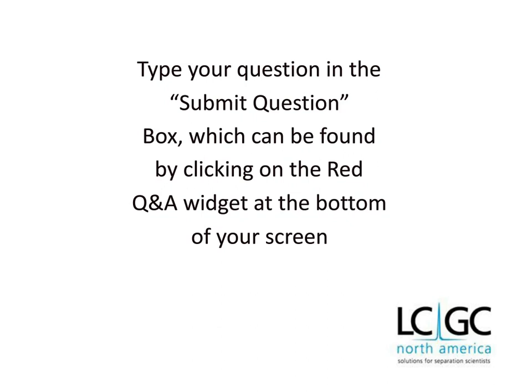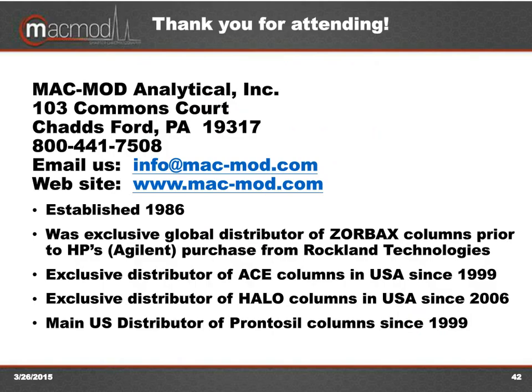Okay, Tom, our first question is, can you please explain once again what is the orthogonal column? I know about orthogonal selectivity like HILIC in some applications, but not columns. Thank you. Well, certainly different modes of chromatography can be orthogonal, like HILIC compared to reverse phase separations. But in the reverse phase mode, there are columns that are very similar in selectivity and retention, or similar in selectivity but not so much in retention.